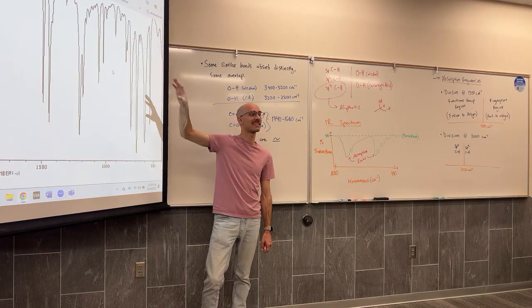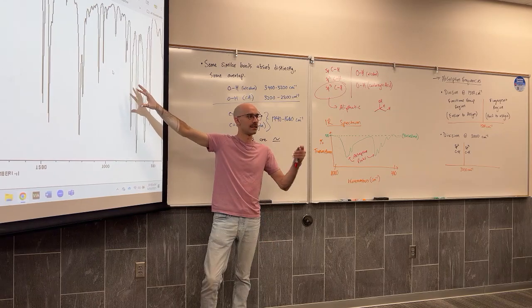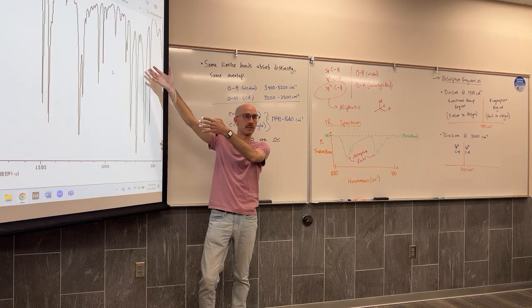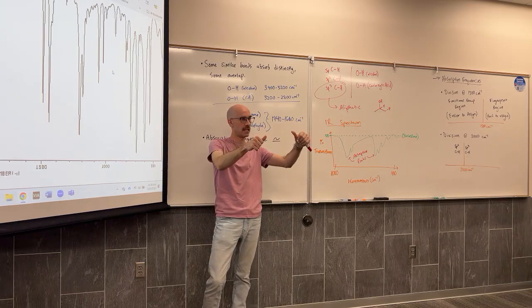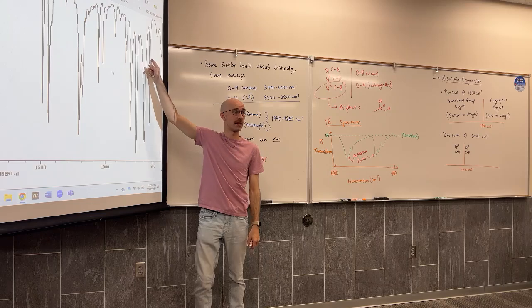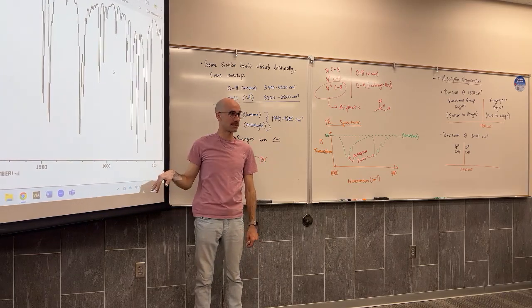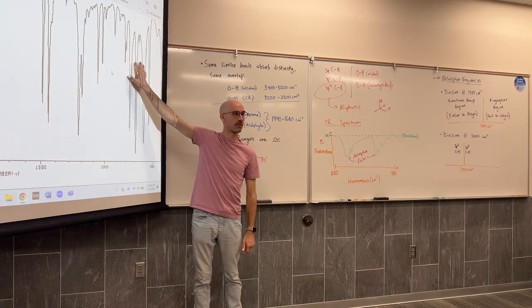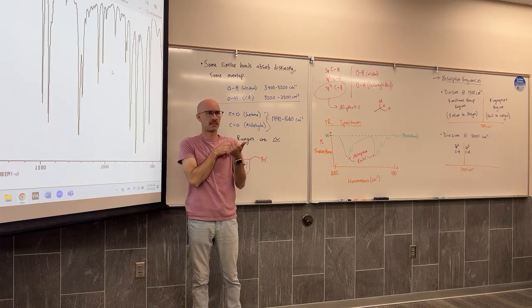I could take an experimental sample of this molecule and a literature sample, this, SDBS. And I could match up those spectra to each other, and if the absorption has the same number of peaks, at the same wave numbers, with the same intensity, they're a match. This acts as a fingerprint to the molecule, very similar to how mass spec acts as a fingerprint to the molecule.